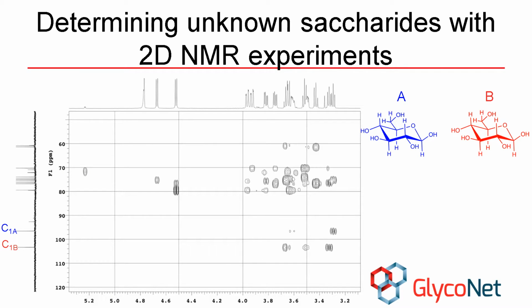So far, we have used the HMQC to identify our anomeric protons, and the TOCSY to identify which peaks belong to which monosaccharide unit. The COSY was used to assign specific chemical shifts to each proton, and then the coupling constants were used to determine the identity of our monosaccharide units. The last step is to determine whether or not the monosaccharides are linked together to form a disaccharide, or if the sample is a mix of alpha-beta anomers.